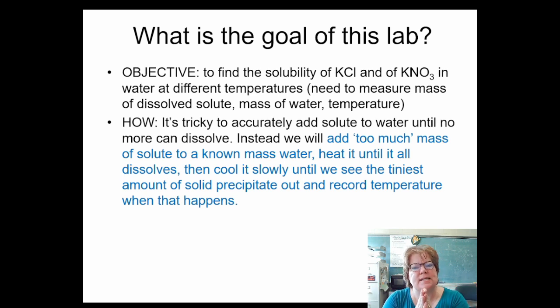So the idea is that in our mind and the way the graph works, the temperature changes. We change the temperature and see what is the solubility. It turns out in practical ways, that's not actually so reasonable to do. So in practical ways, what we're really going to be doing is we're going to change the mixture and pick a solubility.